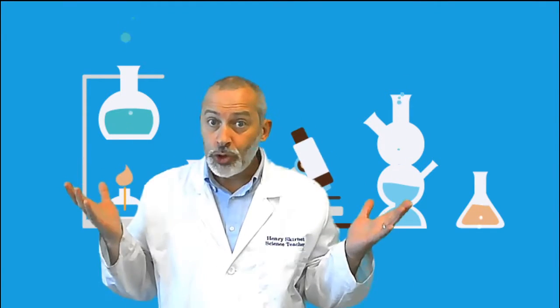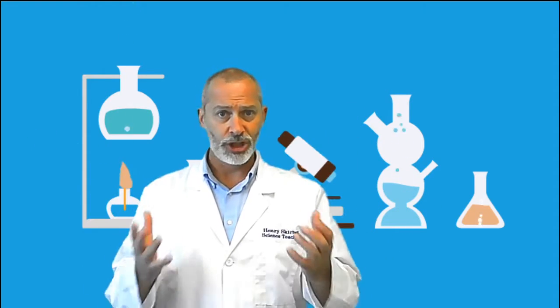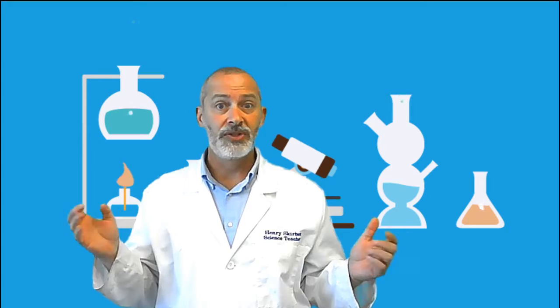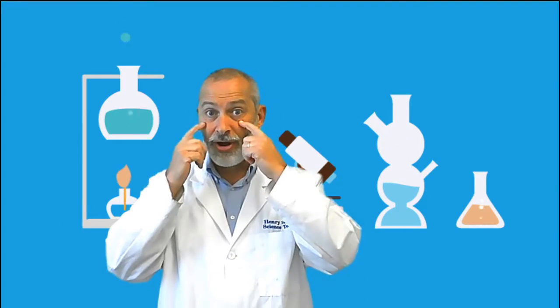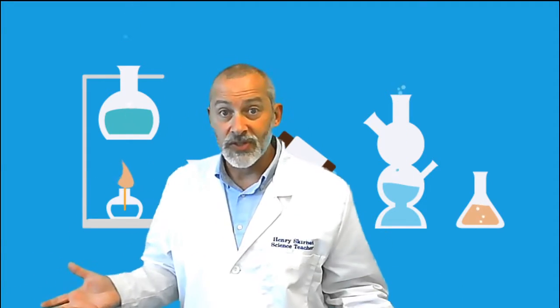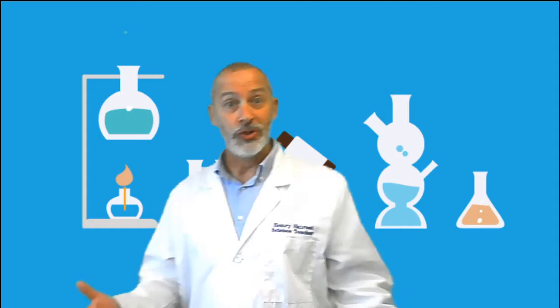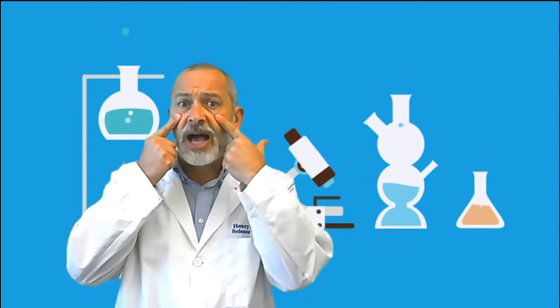Now, we all have two eyeballs. Hopefully we all realize that, unless you've suffered some tragic accident, perhaps. We all have two eyes, which gives us binocular vision. But just like everything else, they're not really identical. There are some differences. Maybe you've heard that one of your legs is slightly longer than another, which makes you eventually walk in a circle if you're lost in the woods, which is why you should stay put if you're lost in the woods. But let's get back to the eyes.